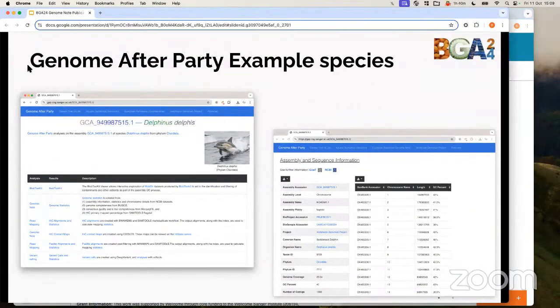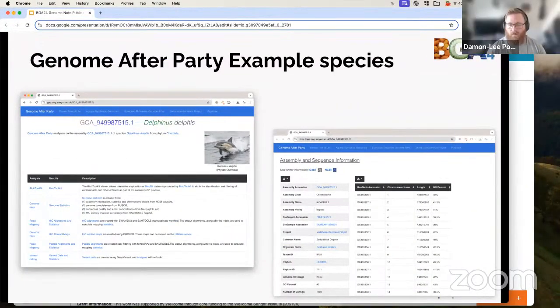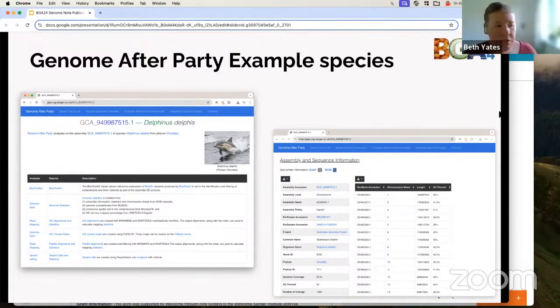There's one in the Zoom chat asking whether or not the Universal Genome Notes platform requires any coding experience. The platform itself, no, it shouldn't. The pipeline, the platform would essentially be a UI. You would be able to make any edits there, but it would run the pipelines itself. You wouldn't need to know anything about those.